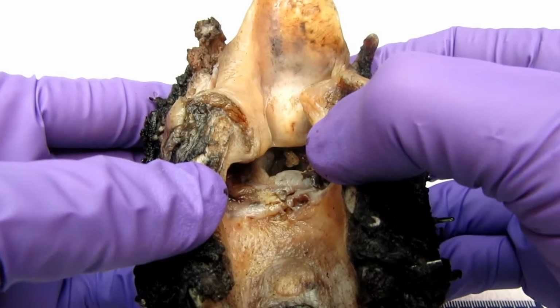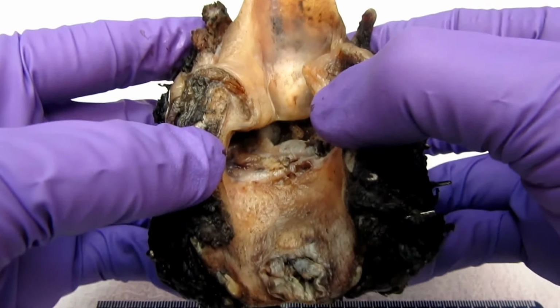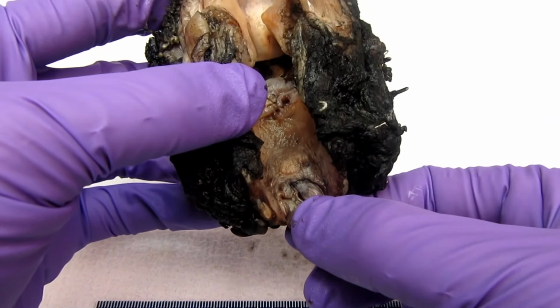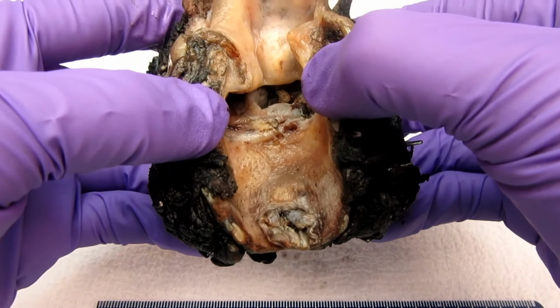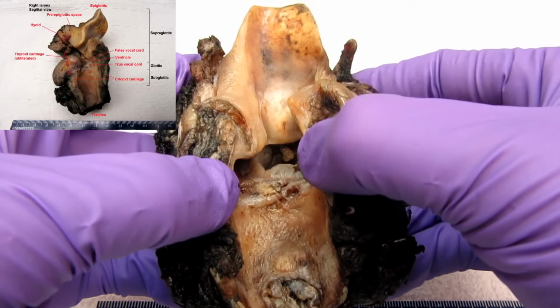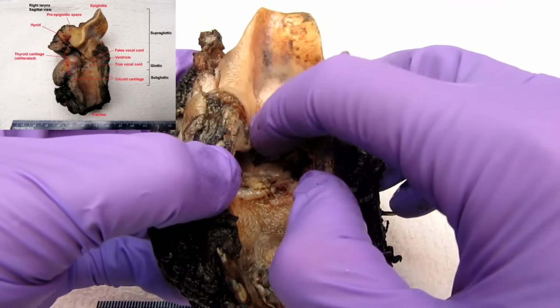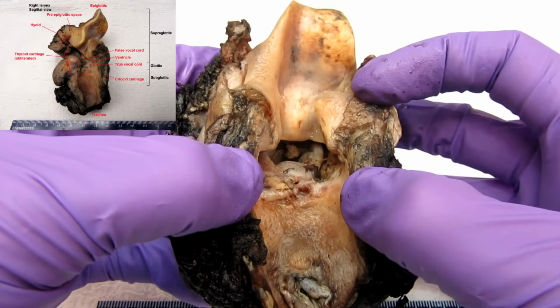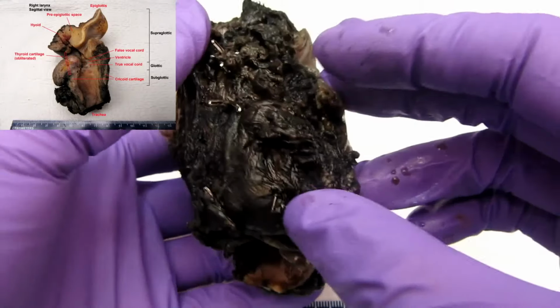So from this view, it's clear that this is actually our necrotic lesion and not a tracheostomy site because it's way too far up. This is our trach site, which is right where it's supposed to be within the trachea. Another anatomic structure we need to think about is the thyroid cartilage, which is found immediately superior to the cricoid cartilage on the anterior aspect of the specimen. The thyroid was also taken out with this specimen, and it'll be found inferior to the thyroid cartilage in this region.